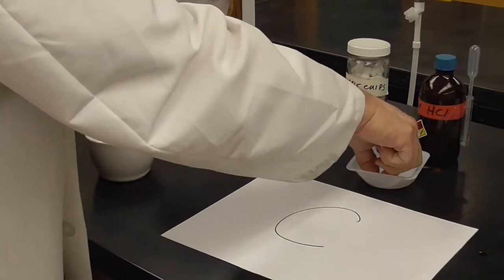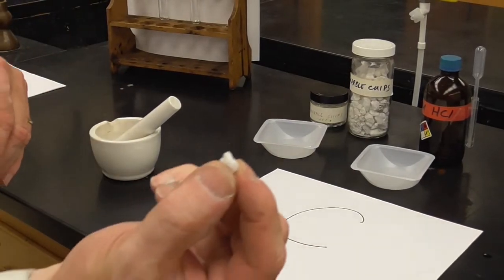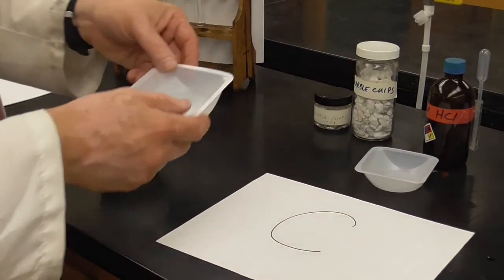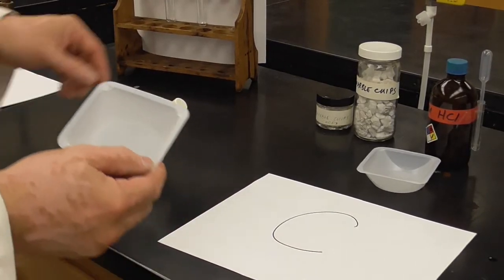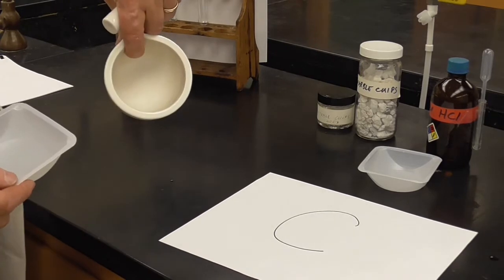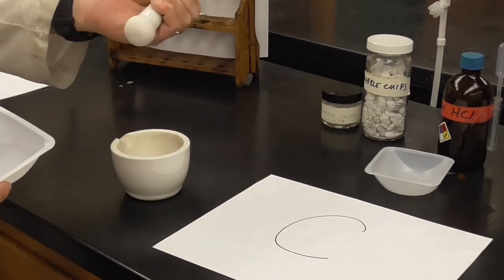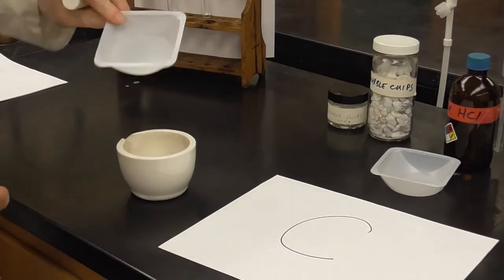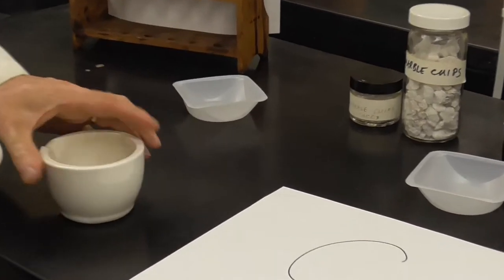One of the chips here, and it looks like that, I got about a 0.5 gram chip in this weigh boat. And in this one I got about 0.5, but we're going to crush them up with my mortar and pestle first. And so this is just a bowl and my crusher, my mortar and pestle set, put that in there and grind it up.